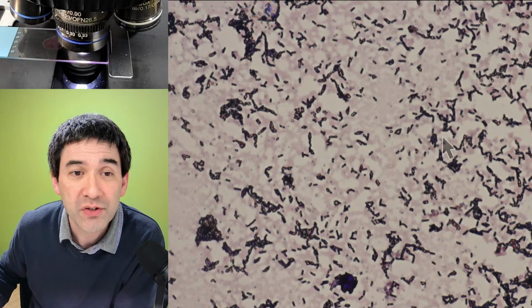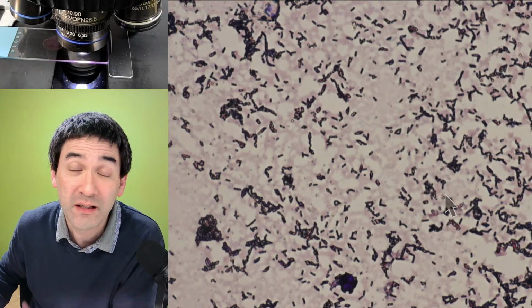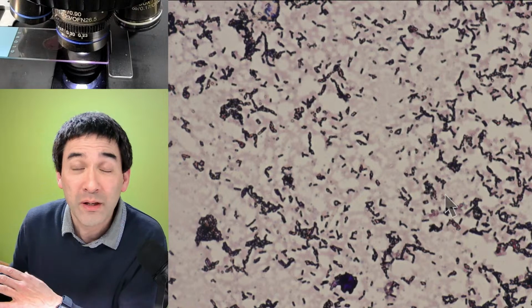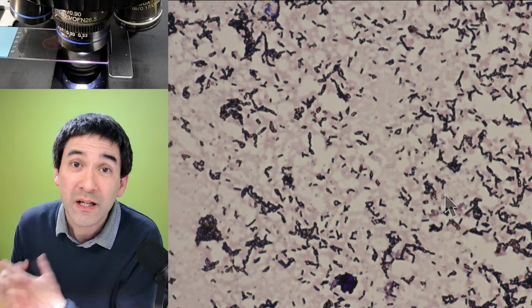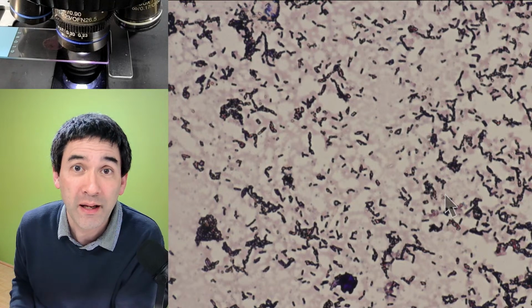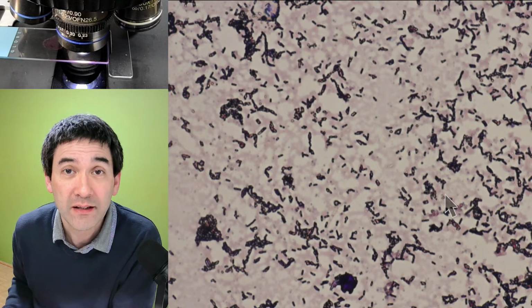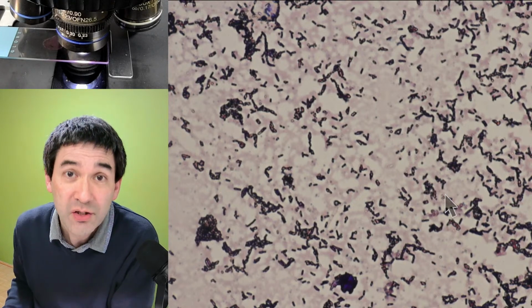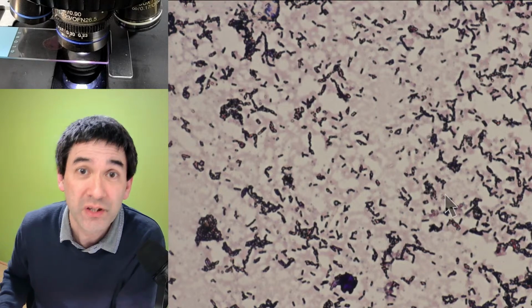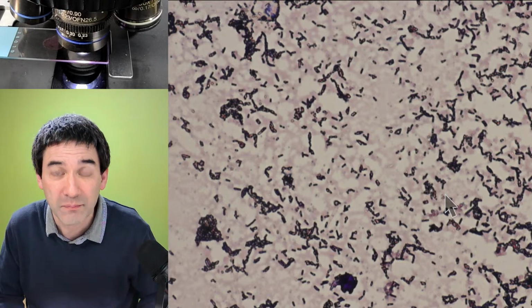Okay, so in other words, the Gram staining technique that I'm showing you here allows you to distinguish between so-called Gram-positive and Gram-negative bacteria. The Gram staining technique was developed by Hans Christian Gram. He was a bacteriologist in the 19th century, and this Gram staining technique was very important and still is used today. I have myself used it during my university time. I can talk a little bit about that as well.